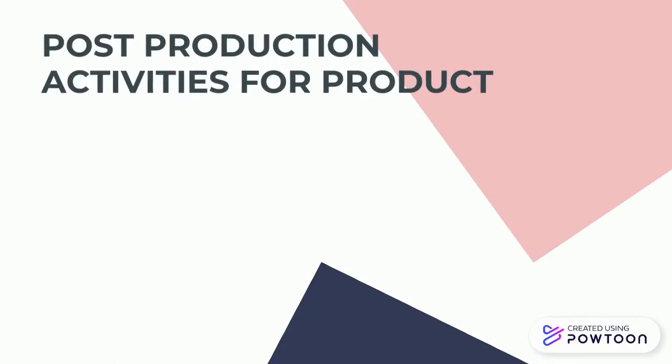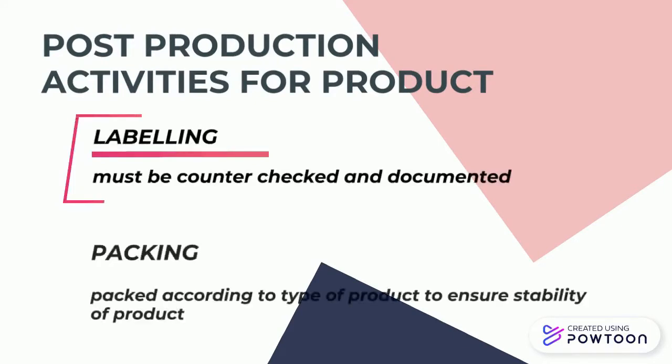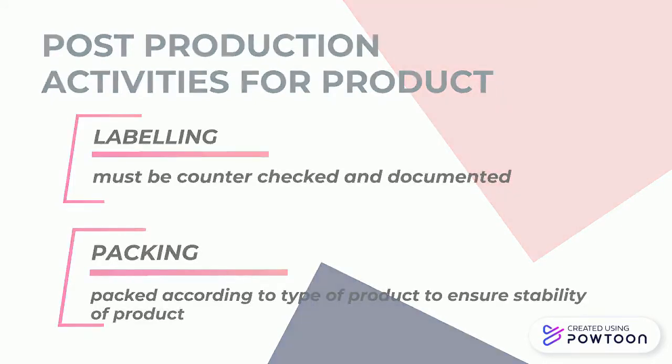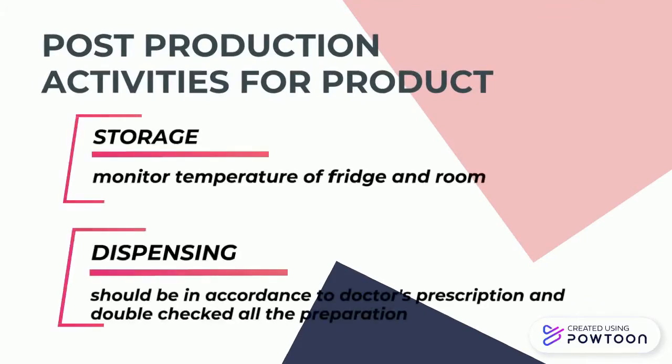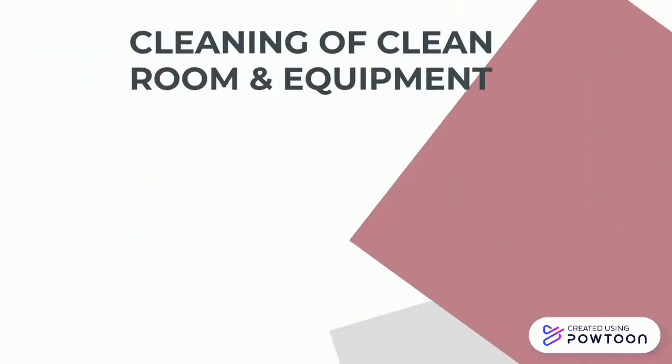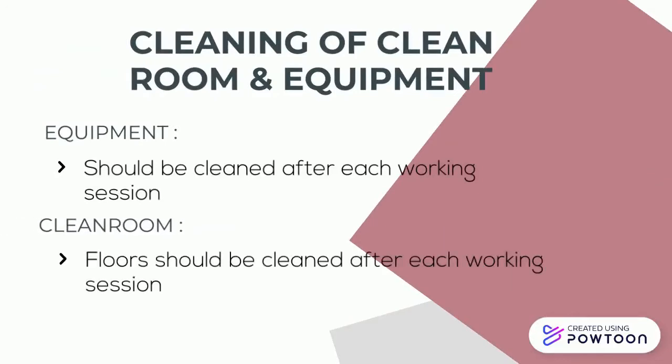Post-production activities for product consist of labeling, packing, storage, and dispensing. Cleaning of clean room and equipment. All the equipments and floors should be cleaned after each working session.